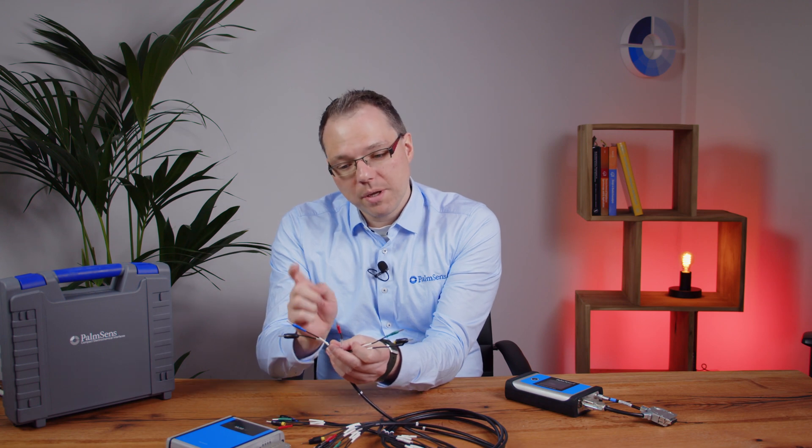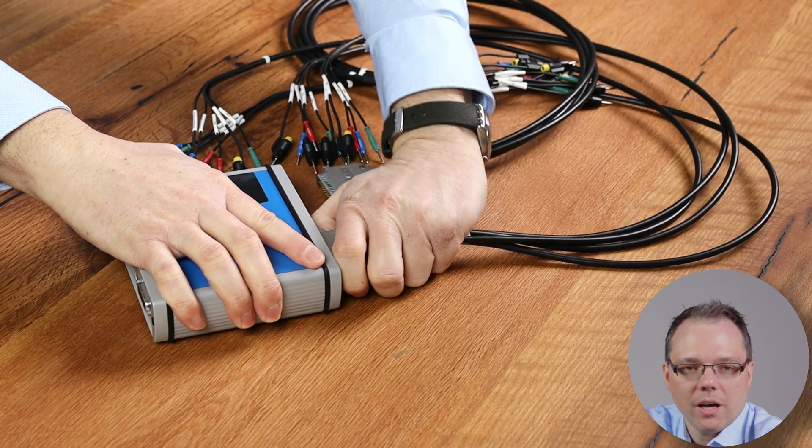This is a lot of cables, but these cables show you that you have a lot of options for how to connect to your cell. You can have eight individual cells each with three electrodes: a reference, counter, and working electrode. Of course, as usual, you can make this a two-electrode setup by having a working electrode and a combined counter-reference electrode. Another option is to switch off the multiplexing only for the reference and counter electrode and only multiplex the working electrodes. This means you would use multiple working electrodes in the same cell that share the same reference and counter electrode.